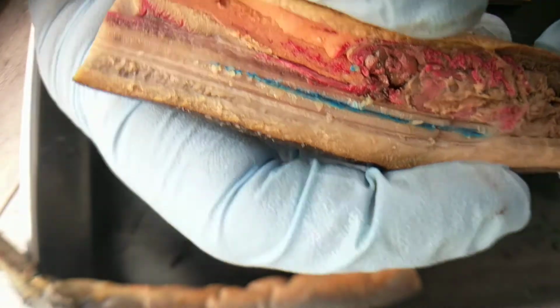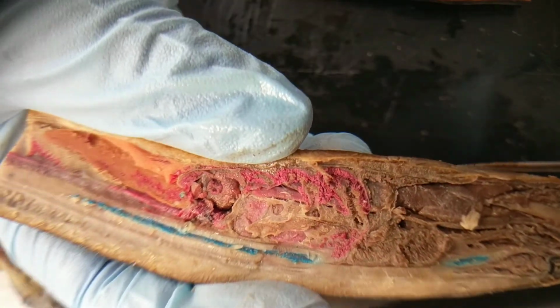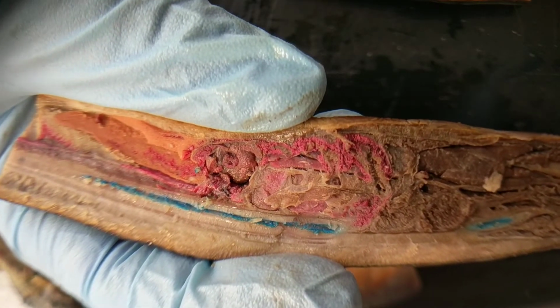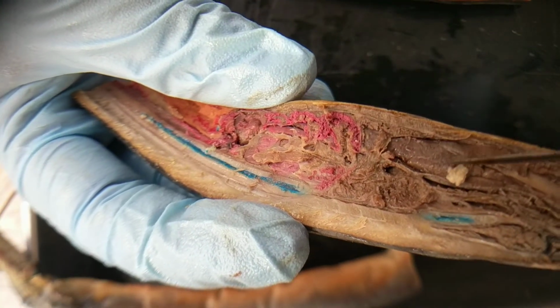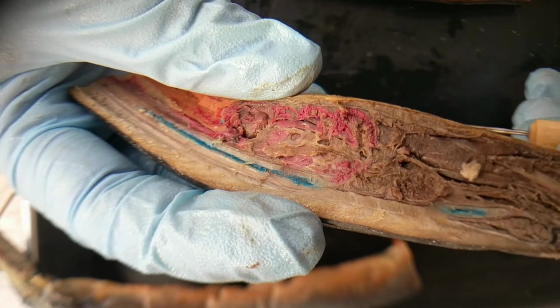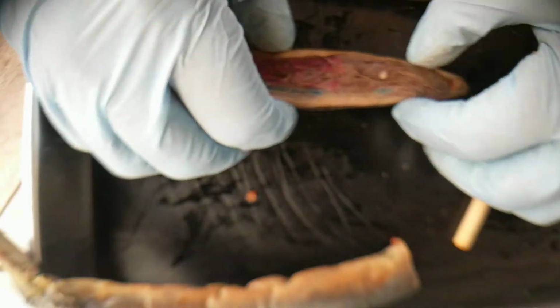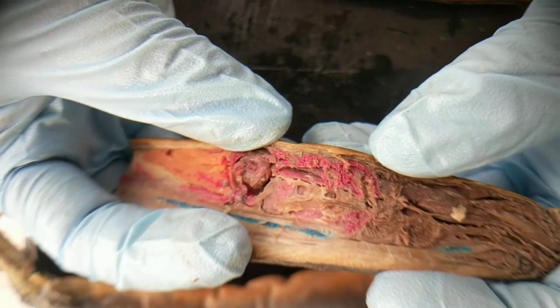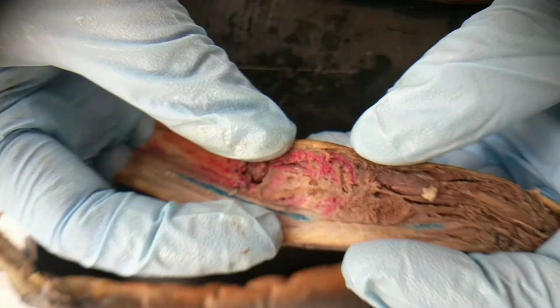Okay, the gill slits. So another chordate synapomorphy is gill slits, also known as pharyngeal slits, because they're in the pharynx, also known as pharyngeal arches. The lamprey has its gill slits formed into a branchial basket, so essentially the gills are joined together into this circular basket shape, and that's a derived feature of the lampreys. We don't know what the ancestor had, but that's just what the lampreys have.